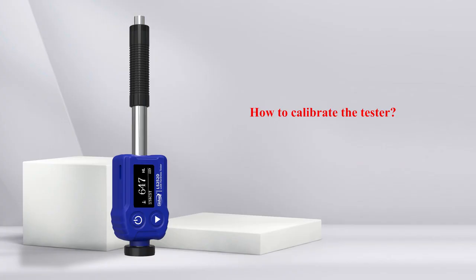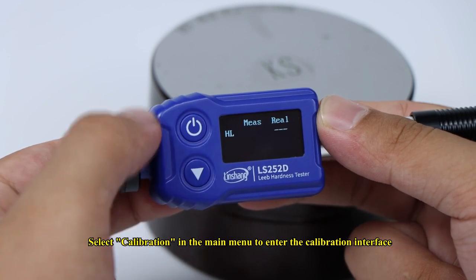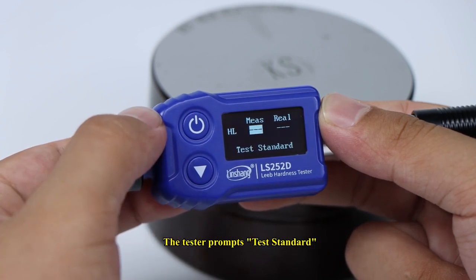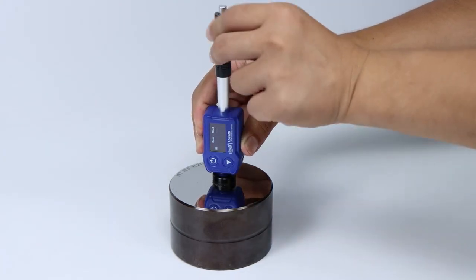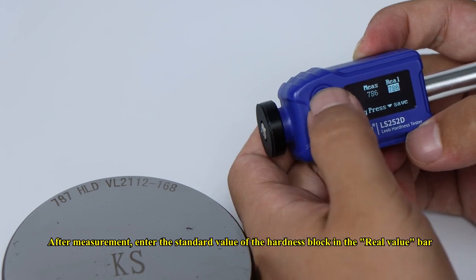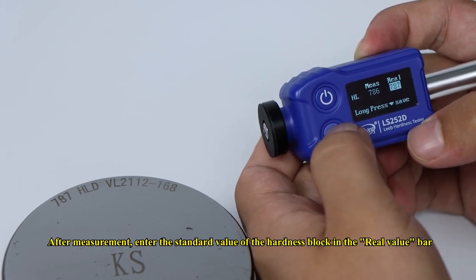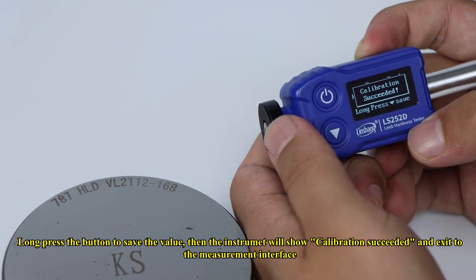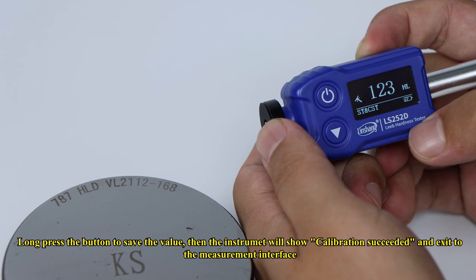To calibrate the tester, select Calibration in the main menu to enter the calibration interface. The tester prompts 'Test Standard' — follow the prompts. After measurement, enter the standard value of the hardness block in the real value bar. Long press the button to save the value, and the instrument will show calibration succeeded and exit to the measurement interface.